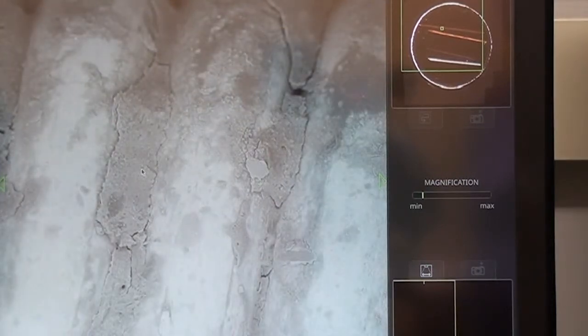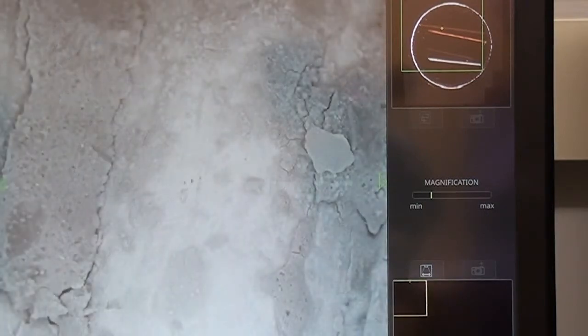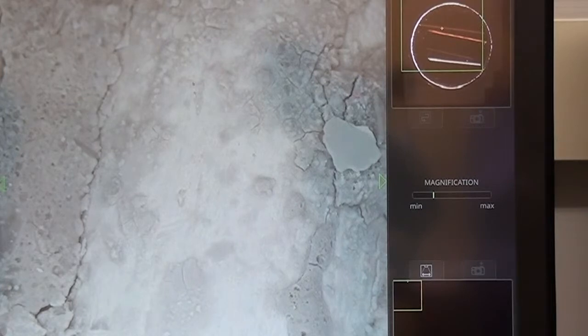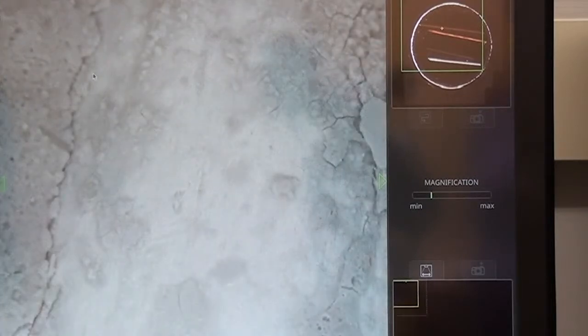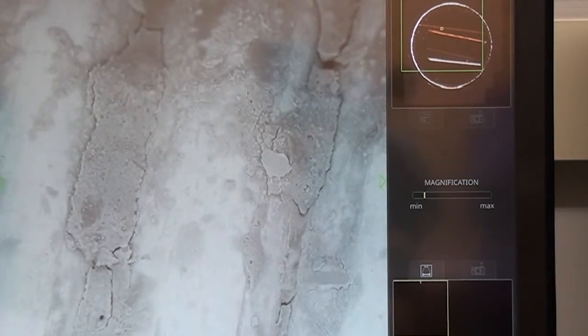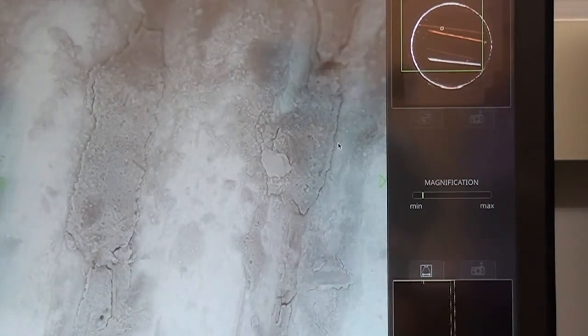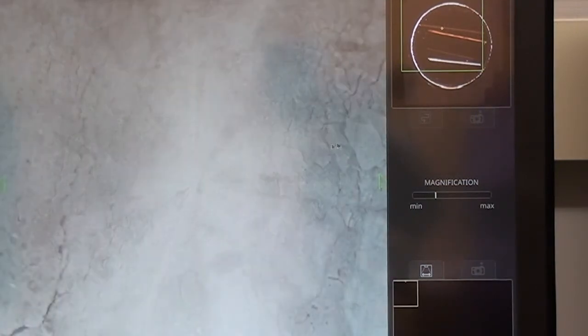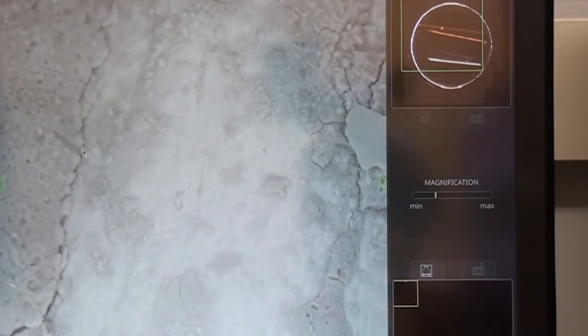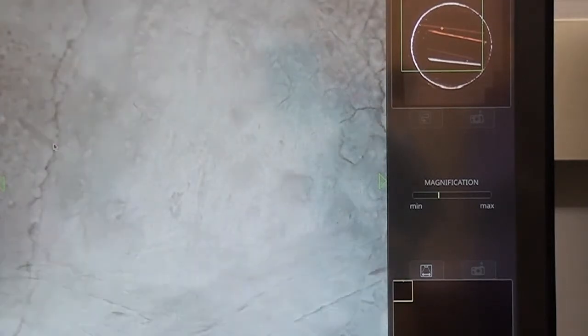So again, we zoom in over here. Look at the structure, looks much more worn out, used, different spots of oxidation, cracks, and we can keep on zooming in here.